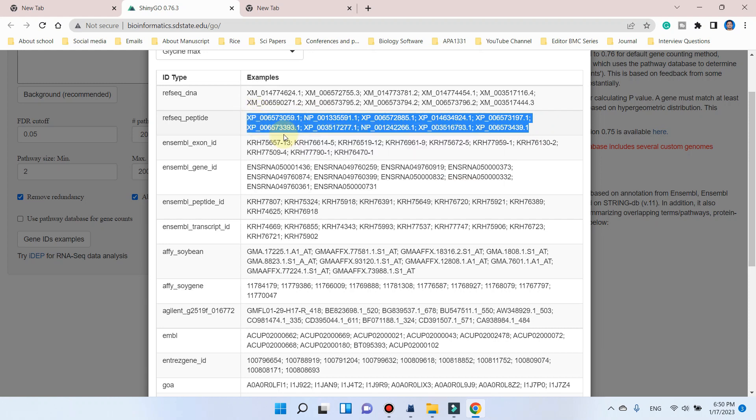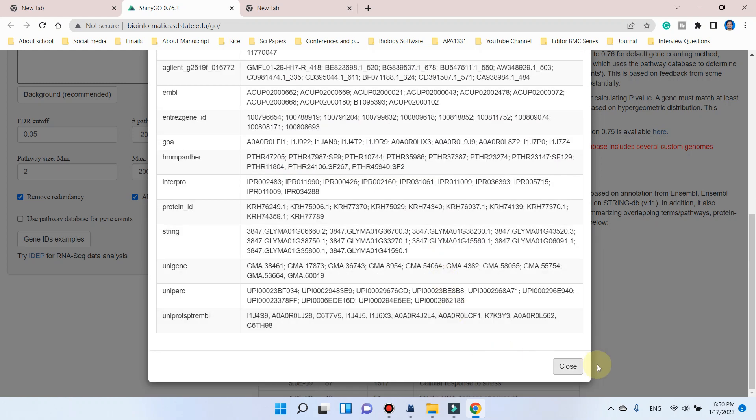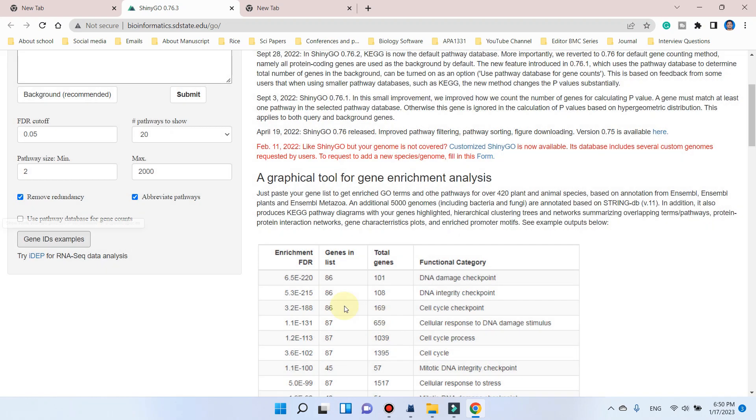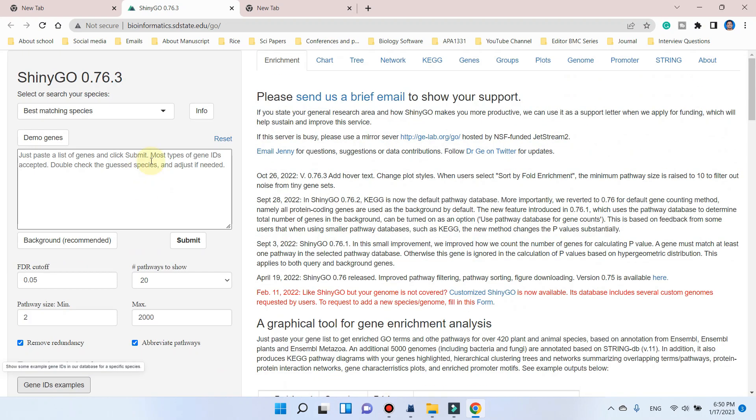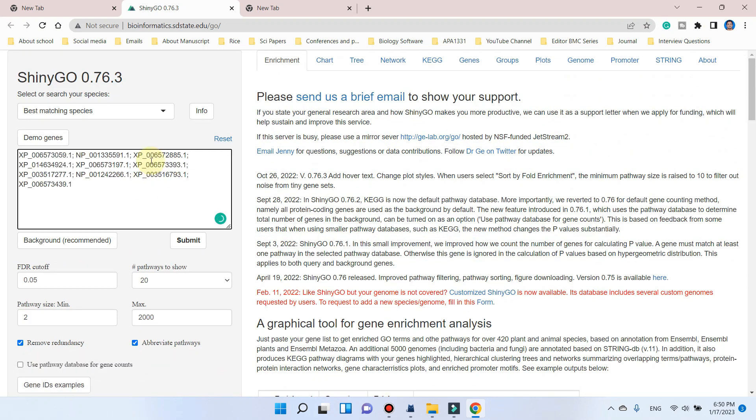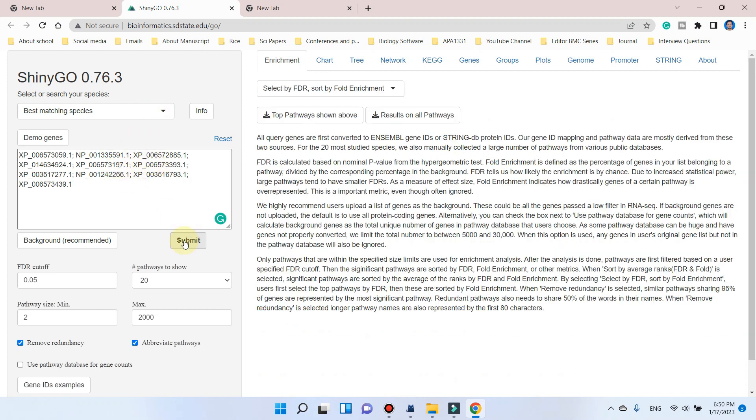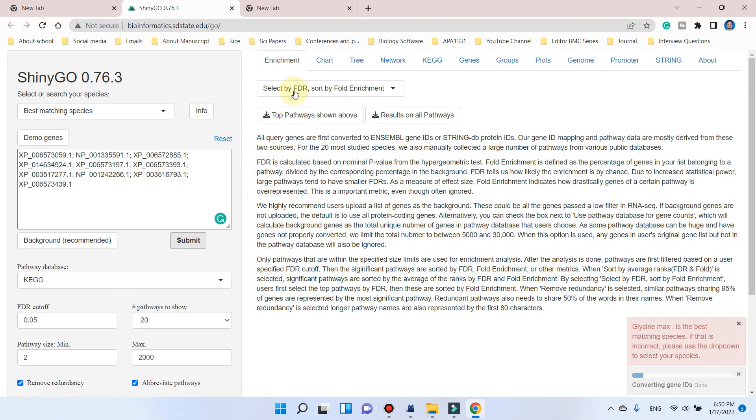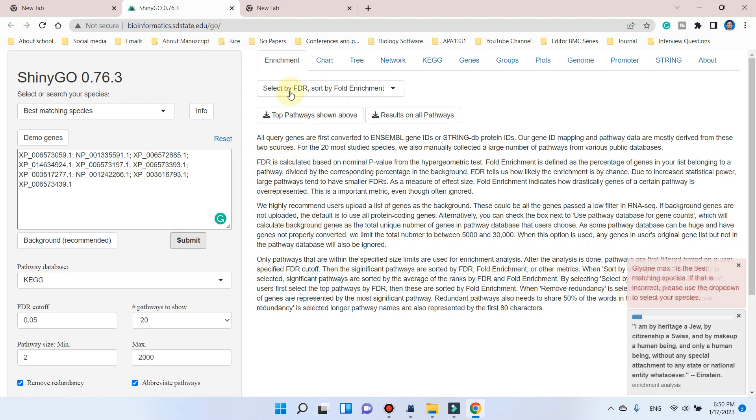We can copy this one, and we can try to close this one. Now here, if we paste this one and if we try to submit this, you can see here, now the problem of ID recognition will not occur.